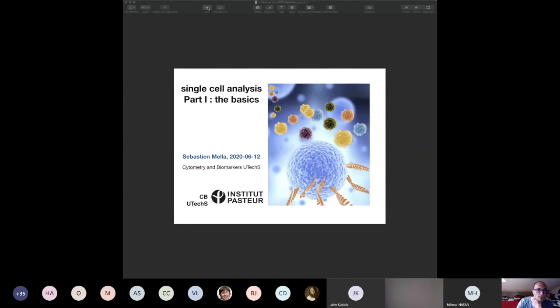We did the sample prep, we did the library prep and the sequencing. And now we are at the analysis step. In the single cell landscape, there's a lot of things you can analyze actually. I'm going to focus on RNA transcriptomic single cell and also a bit of protein analysis with the cell surface proteins. We will also see in the second part of the talk how we can integrate different samples coming from single cell RNA-seq data.